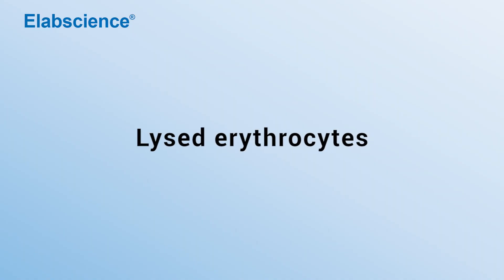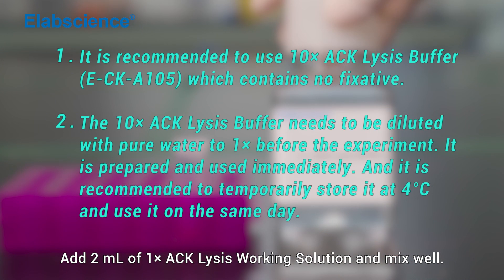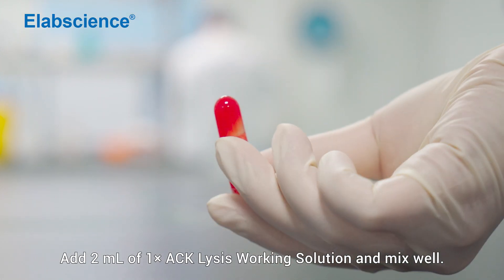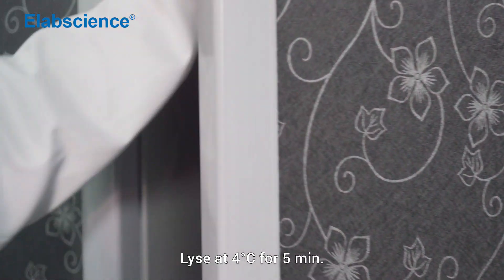Lyse erythrocytes. Add 2 ml of one-time ACK lysis working solution and mix well. Lyse at 4 degrees for 5 minutes.